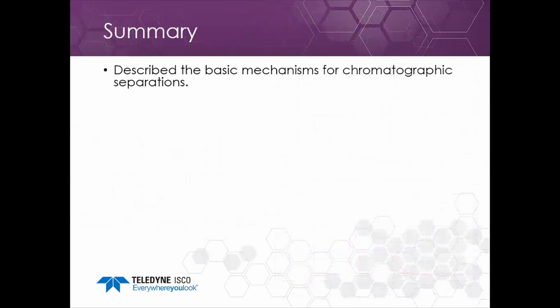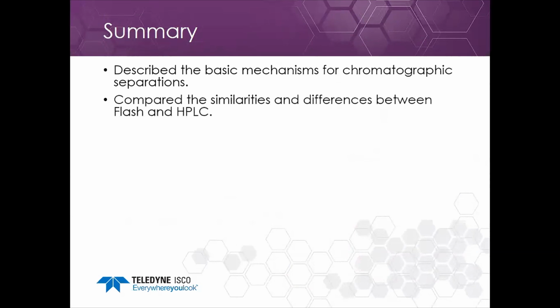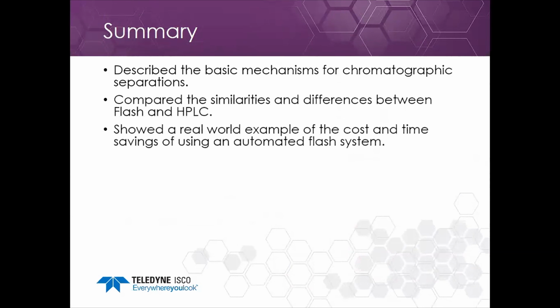So today we've described the basic mechanisms for chromatographic separations. So what things we need to consider: the interaction of the molecule with the solvent and the stationary phase. We compared the similarities and differences between Flash and HPLC.